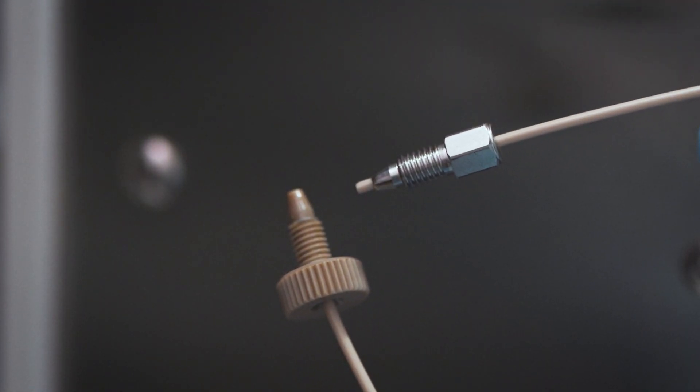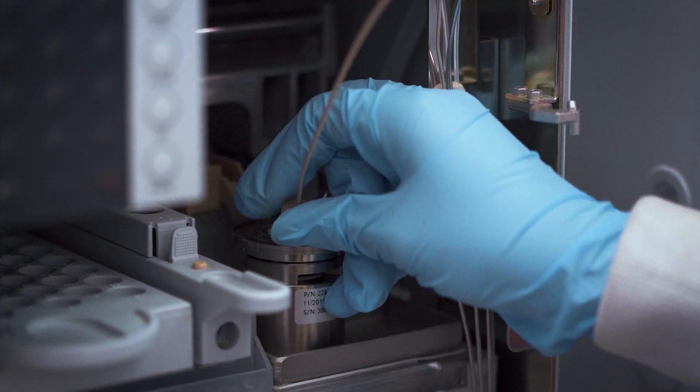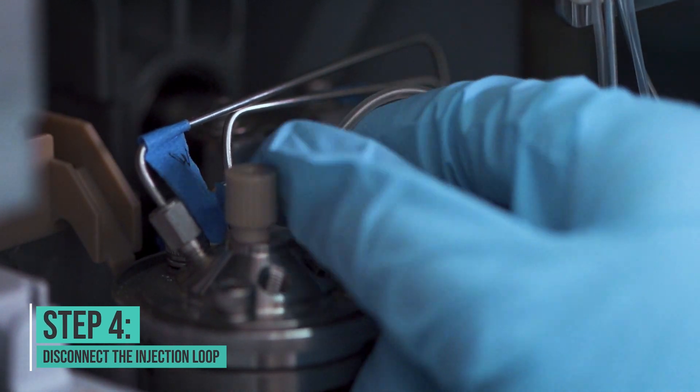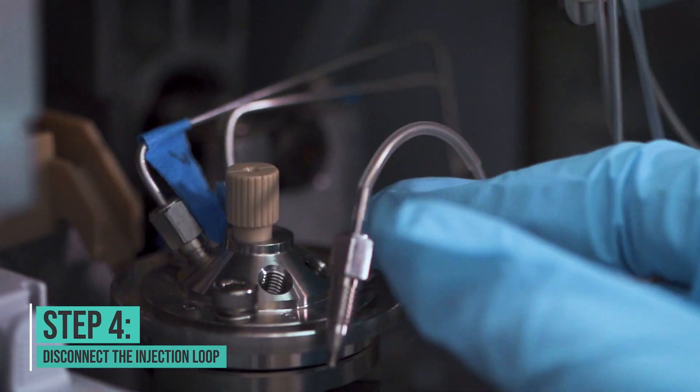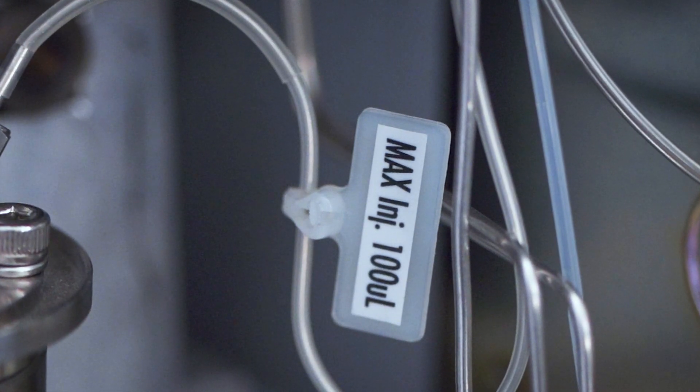Usually when you clog something, the clog is just at the front. The clog usually isn't in the middle of a line or column, so when you flip something around you can normally blow the clog out the back. If that line is still clogged, same idea: disconnect the injection loop and see if the pressure goes down.